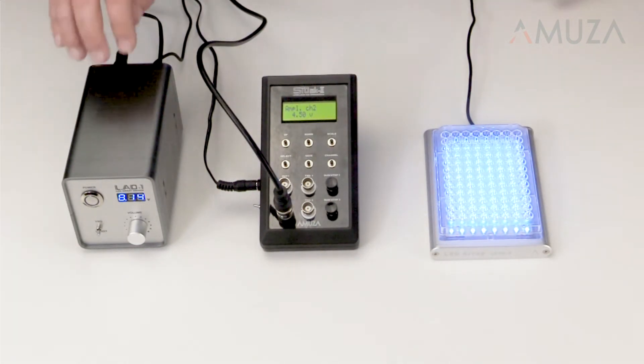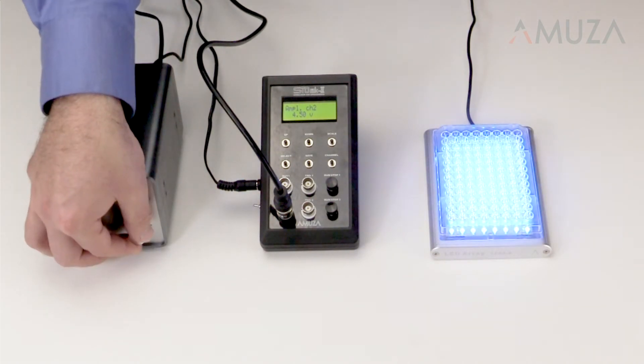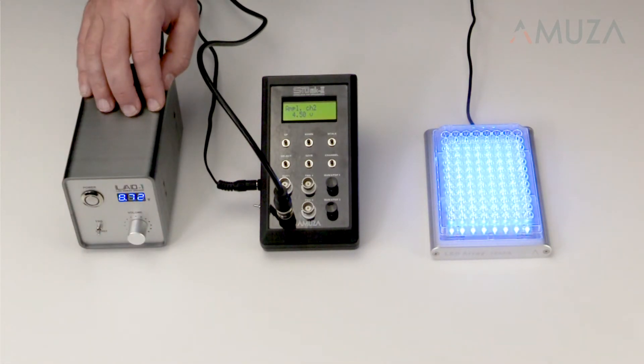The LIDA LED driver can be controlled manually. You can vary the irradiance from 0 up to roughly 1.5 milliwatt per millimeter squared depending on the wavelength. But you can also set the driver to accept low voltage pulses as a trigger.